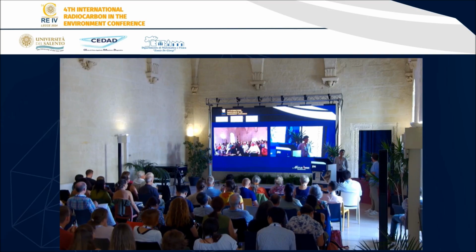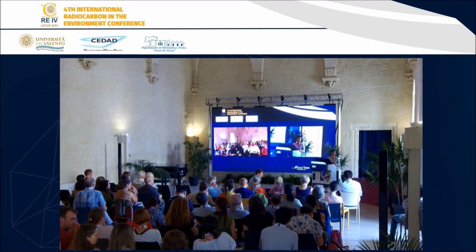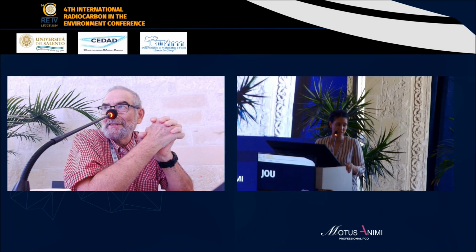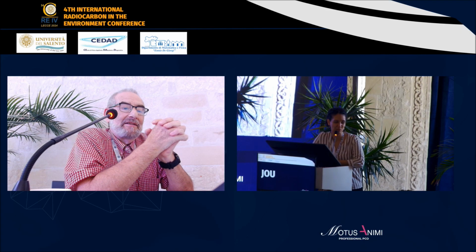I have a question. You show us ethanol, which has something like 70% of modern carbon. How does it come? What's the origin of this ethanol? It's from Brazil. The pMC expected was 100, and because of the automatic pipette we show a very, how can I say, contamination.